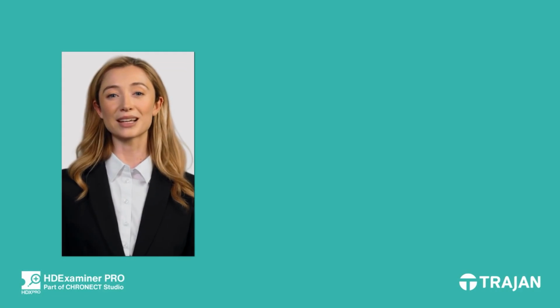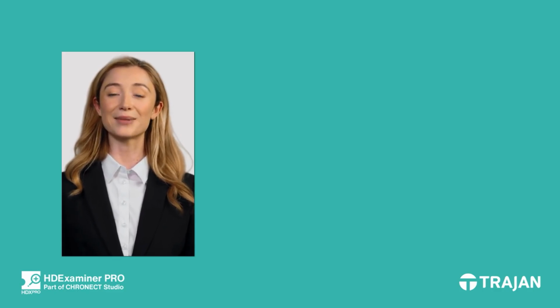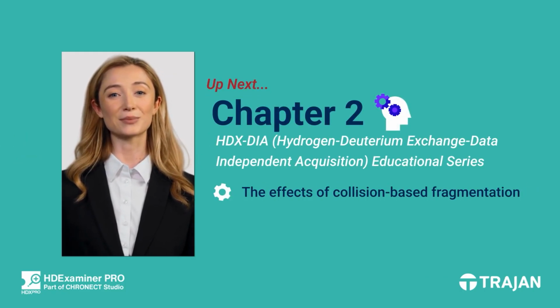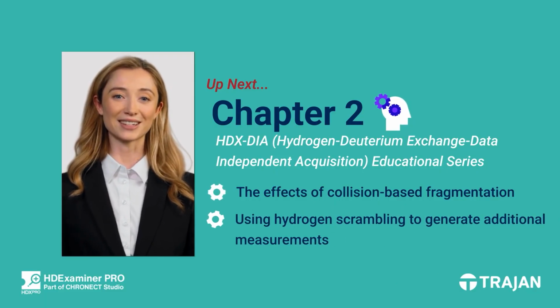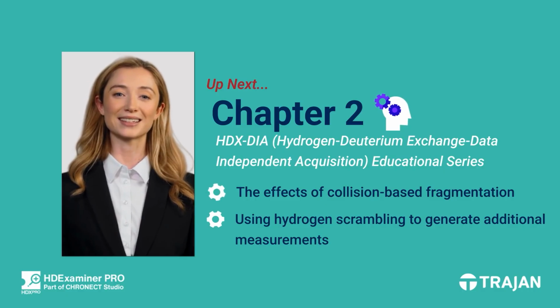In this first chapter, we explored the fundamentals of hydrogen deuterium exchange and its role in revealing the dynamic nature of proteins. In Chapter 2, we will delve into the effects of collision-based fragmentation. You will learn about hydrogen scrambling, why it occurs, and how it can be utilized to generate additional measurements from a single peptide. Let's move on.